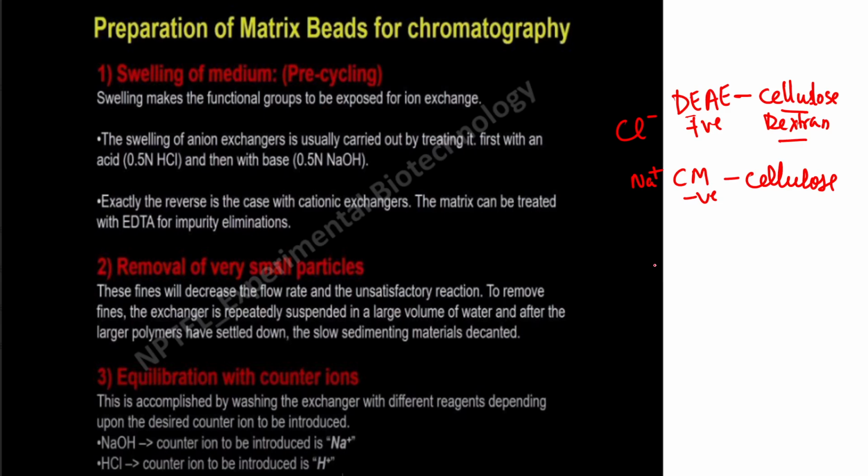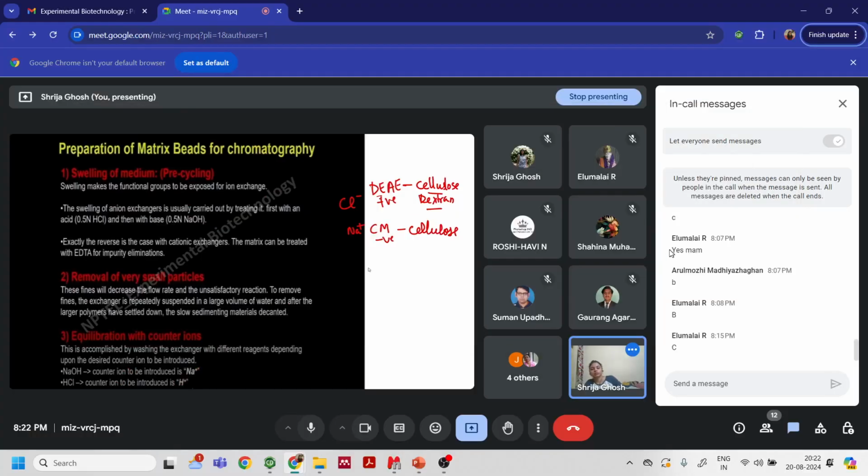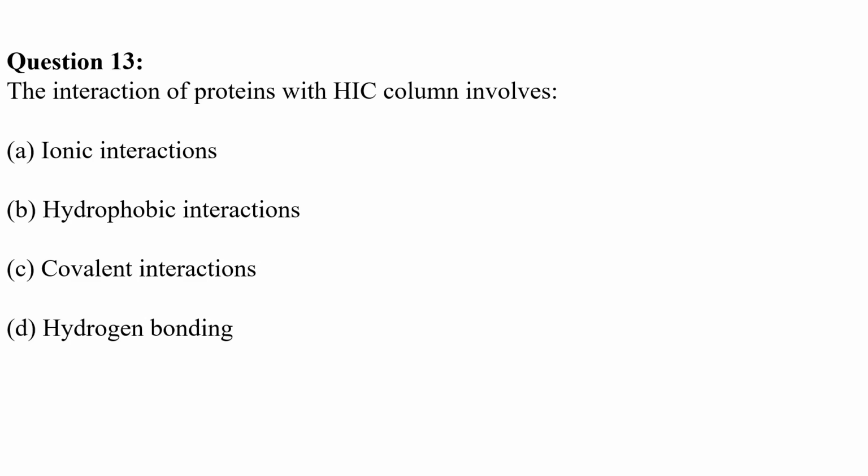Okay. So first step is swelling of the medium, second step is removal of small particles, and then we will have the equilibration step. Is this clear? Yes, ma'am. Okay, very good. So we will move on to the next question.